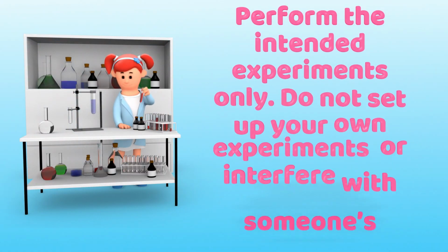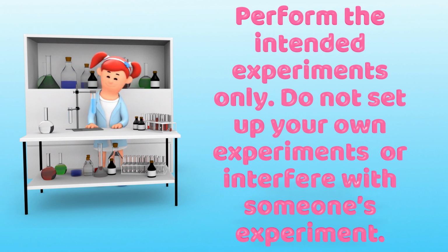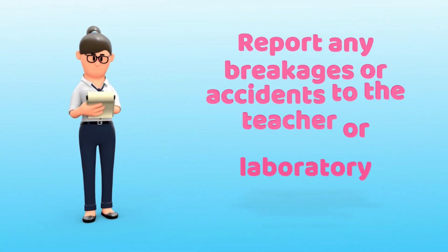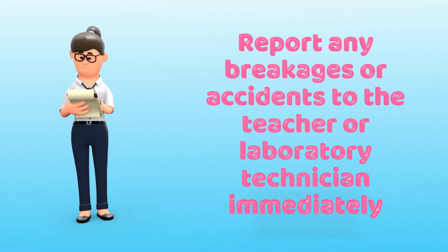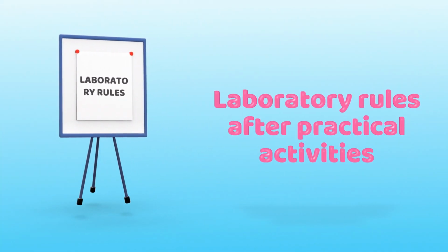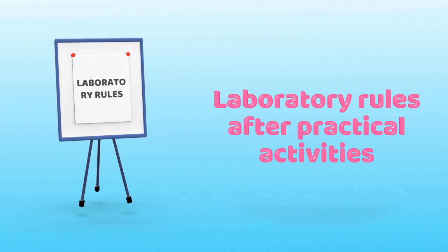Moreover, perform the intended experiments only. Do not set up your own experiments or interfere with someone else's experiments. Last but not least, report any breakages or accidents to the teacher or laboratory technician immediately. Above all, now let's see the laboratory rules after practical activities.